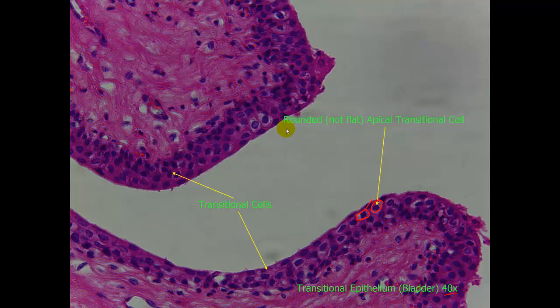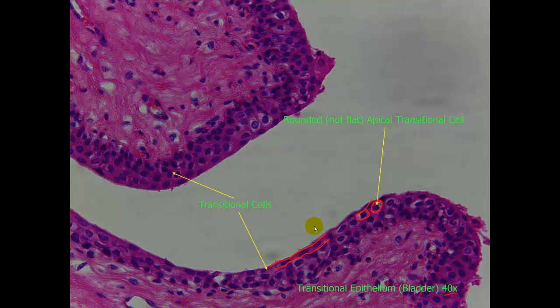You will also see multinucleate cells, or cells that have more than one nucleus. That is very characteristic of transitional epithelial. You will also see these cells in this layer right here that kind of cap the top of the transitional epithelial. Keep in mind the function of transitional epithelium: it is to stretch within the bladder or ureters to allow urine to occupy that space. If you were to look at these cells when they were stretched, they would be much, much more flat.